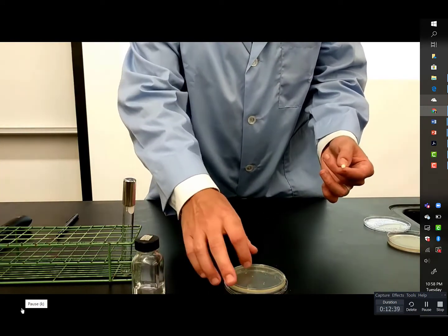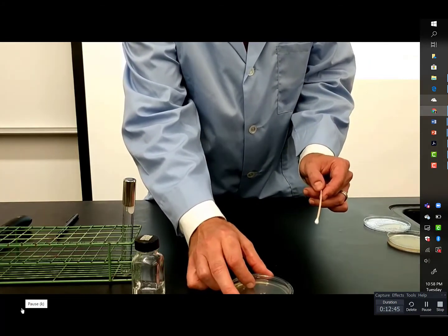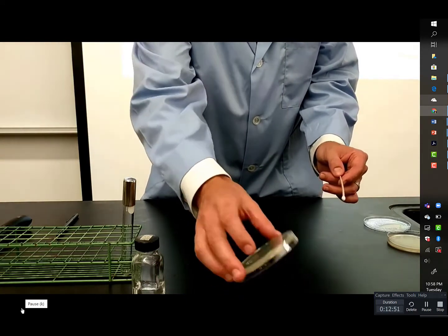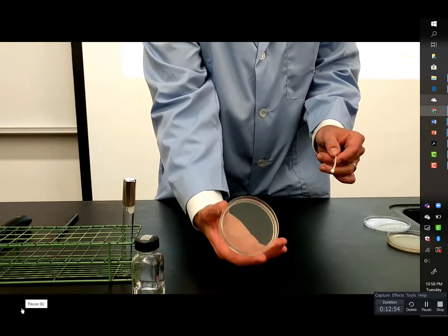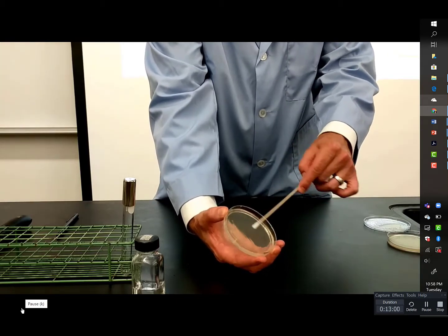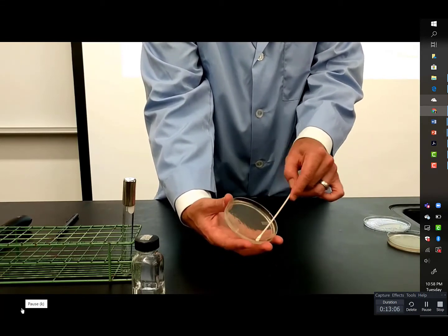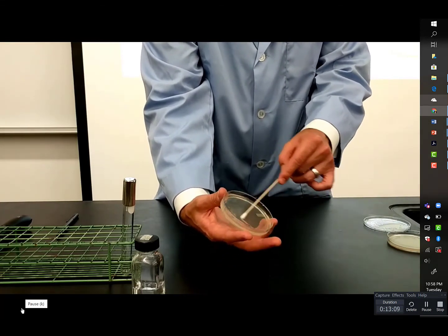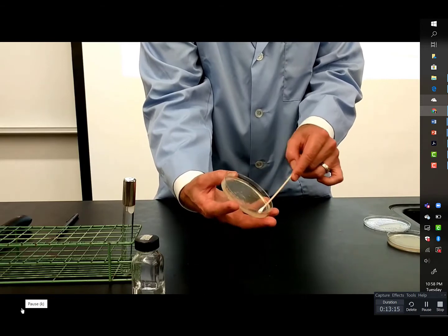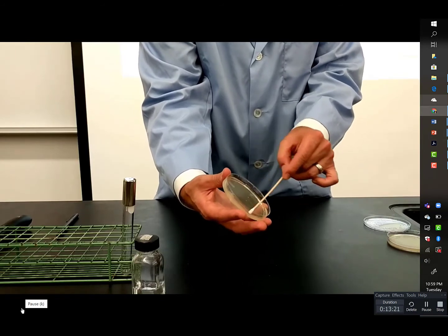All right, so we're not being very precise about the technique of collecting the sample in terms of how many swipes or swabbings, but what I'm going to do is turn my plate over, and let's start with it lid face down, and I'll carefully leave the lid down there and take the open agar, and we'll wipe it around, rotating this around. There's really no wrong way to do this unless you press so hard. It doesn't take much muscle to move the bacteria around and spread them around on the plate, but sometimes students will press so hard that they split into the jelly-like agar. So I'm using a light touch, but I'm being very thorough to make sure that I get all my sample off of there.